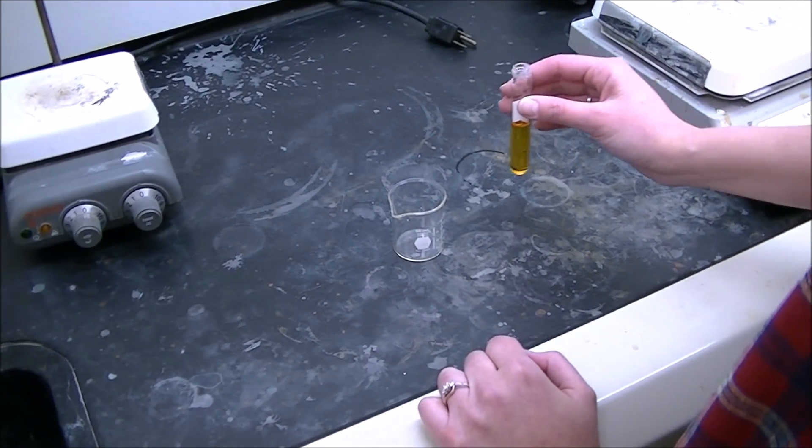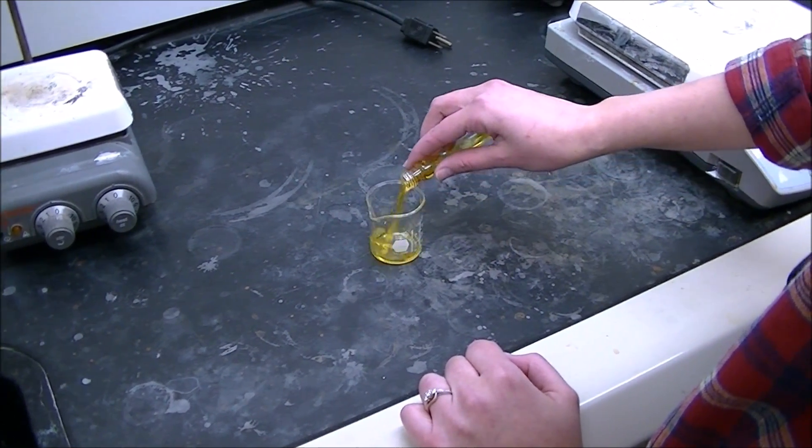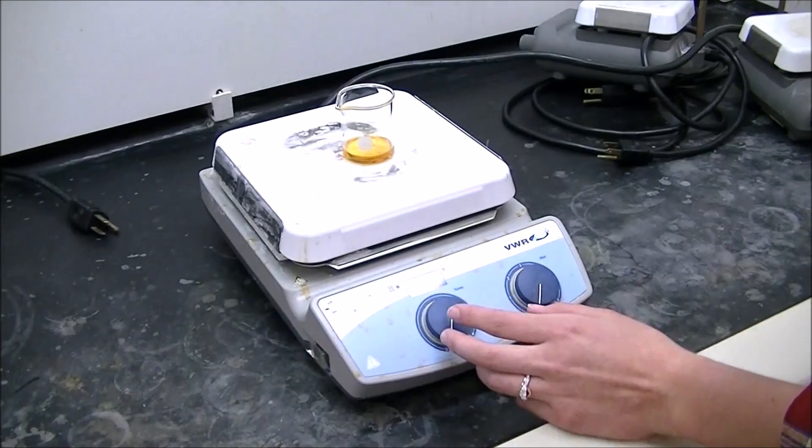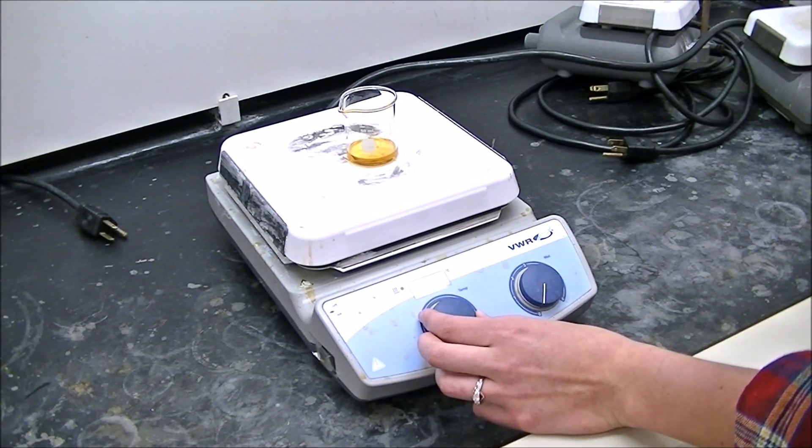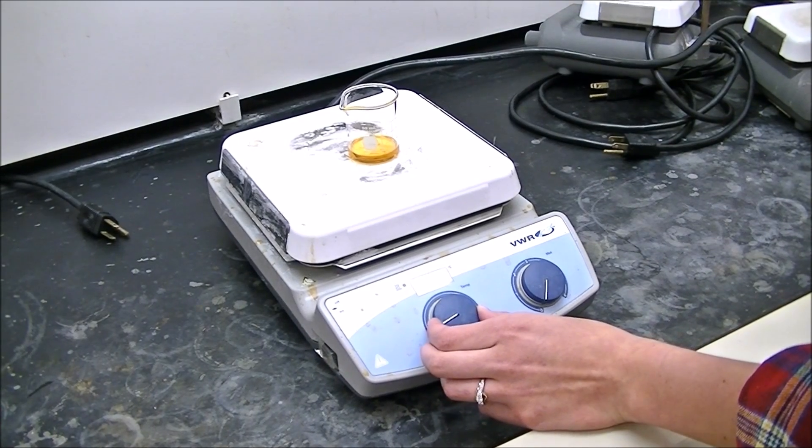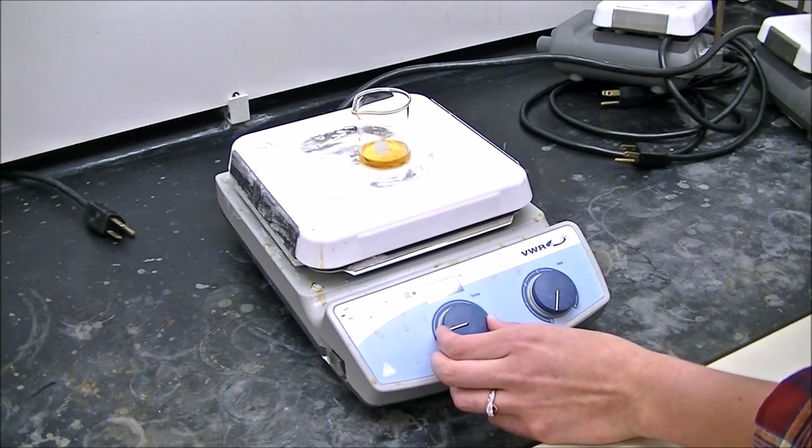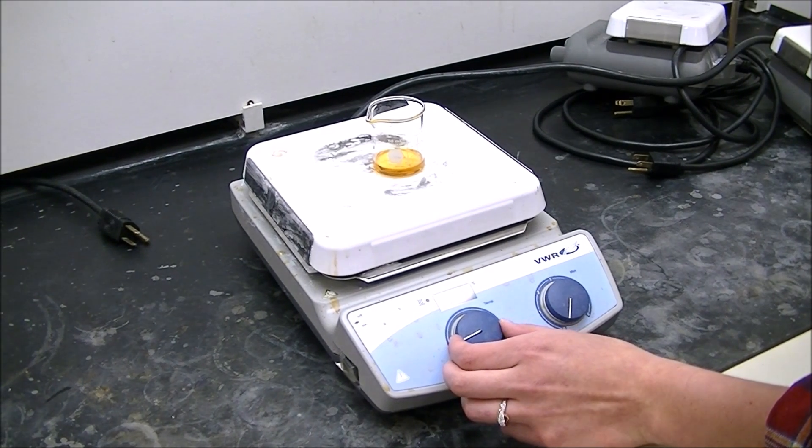Add your azobenzene mixture to a beaker. Boil off nearly all of your methylene chloride under the hood. Remember that methylene chloride has a low boiling point and you'll need to be careful as you reach low volumes.